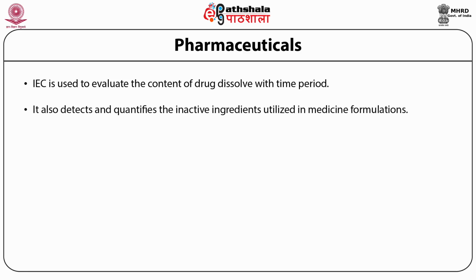It also detects and quantifies the inactive ingredients utilized in medicine formulations. It has made the detection of impurities or constituents that are not chemical entities easy. It provides insights about the contents of drugs that should be given to the patient per day.